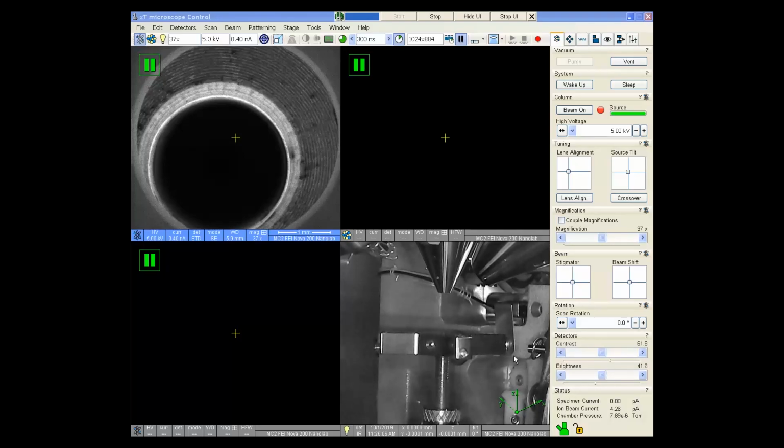Okay, this is going to be a recording. Just needed to shut the door. And I'm going to start the camera up here. Okay, so we're filming.